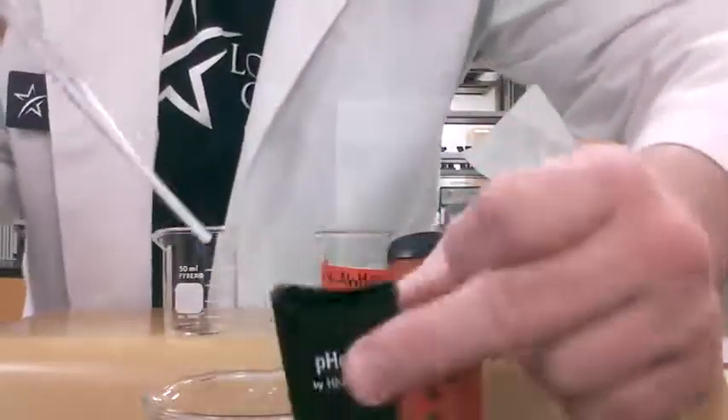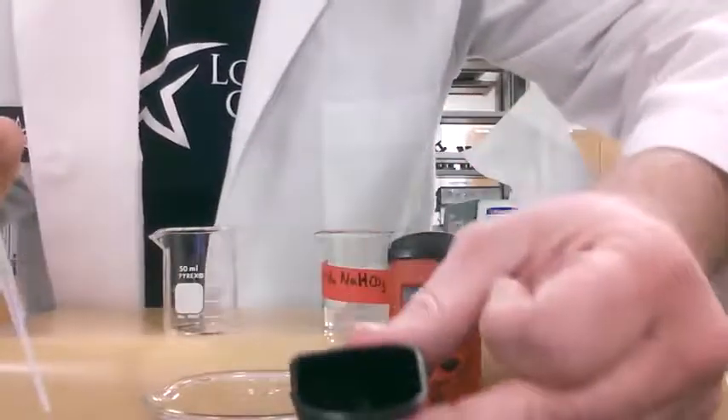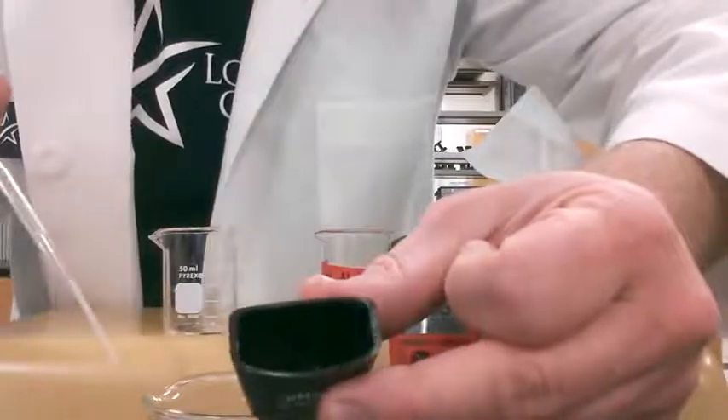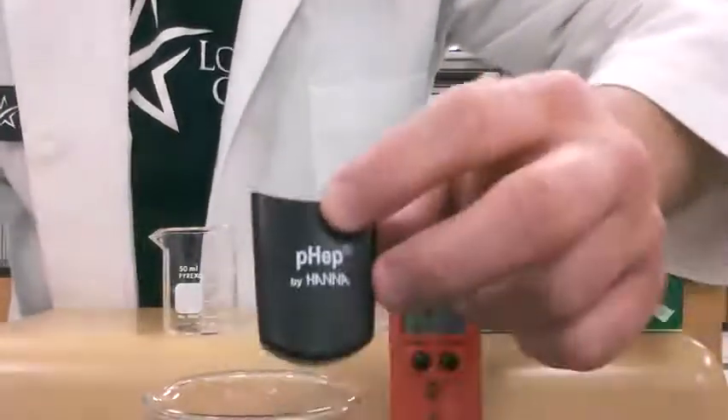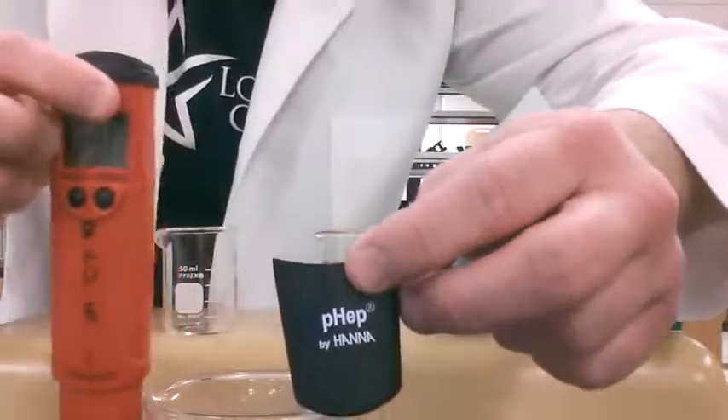Inside the cap there is a small cylinder or circle. We're going to pipette the solution down in there. You may or may not be able to see it, but when you're doing this, look in there and you'll see it. Once that solution is in there, we're ready to put the pH meter back in.